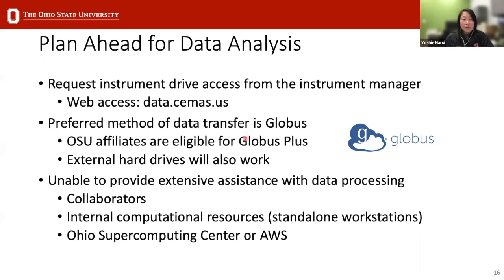We can still do external hard drives as a backup, and I know some labs prefer that. It'll be a little bit slower, right? Because we have to copy it multiple times onto your drive, but that's also an option as well.